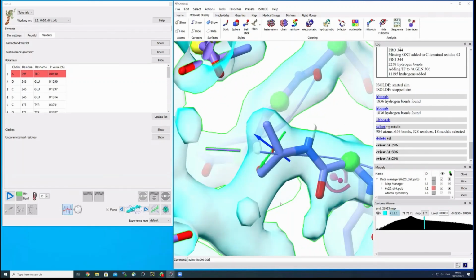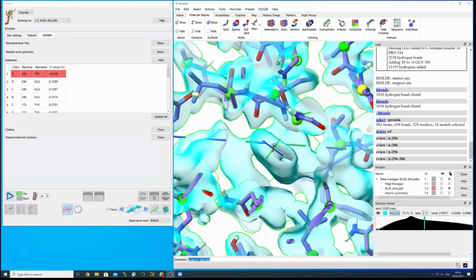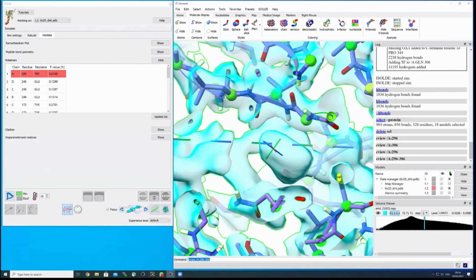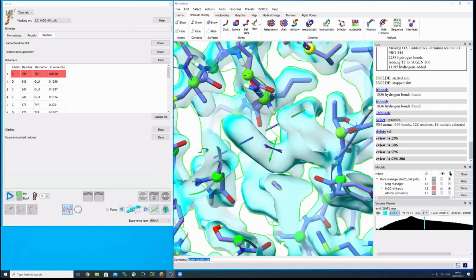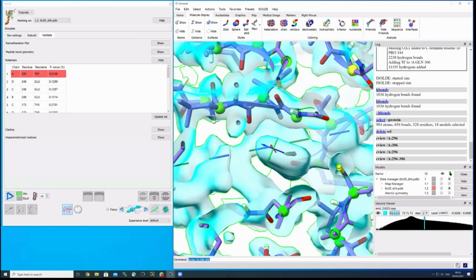Since this is 10 residues in total, you can also give a range, center view from 296 to 306. You will see the entire piece that is basically missing. So we have to model nine residues in there. How to do this?